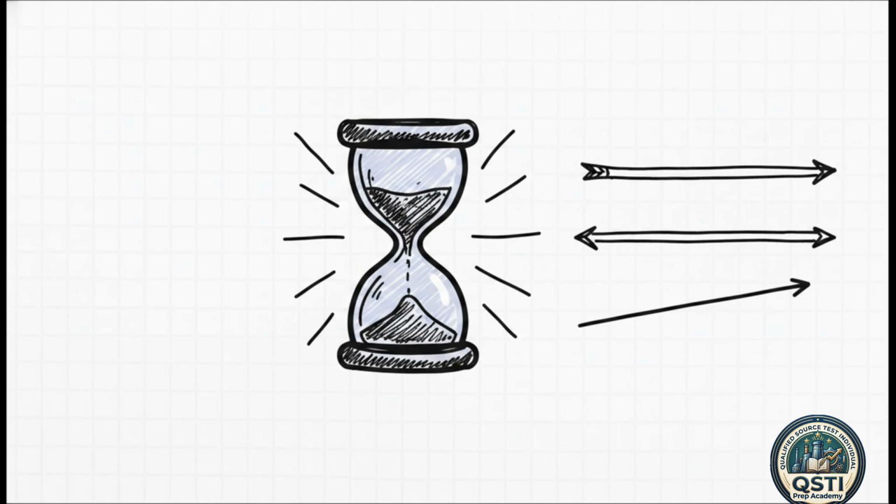When you are actually running that integrated sample, there are some very strict operational rules. You absolutely must sample at a constant rate, keeping it within plus or minus 10%. Also, the sampling run needs to be simultaneous with and for the exact same length of time as the pollutant emission rate test. And here's your ticking clock. Once that sample is taken, you have exactly 8 hours to analyze it for CO2 and O2. Not tomorrow morning, within 8 hours, period.